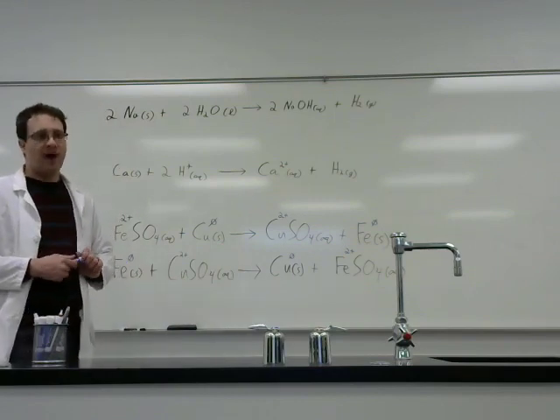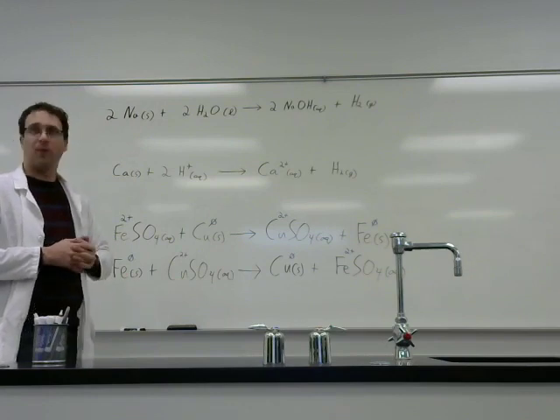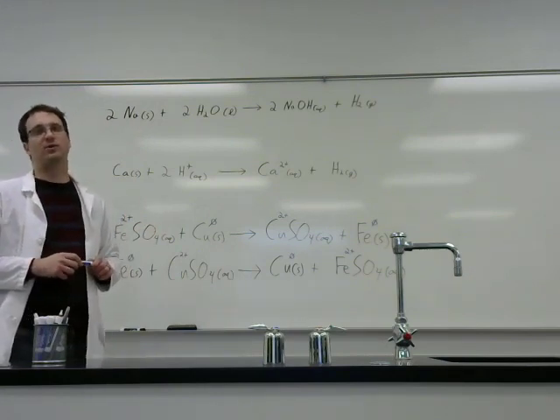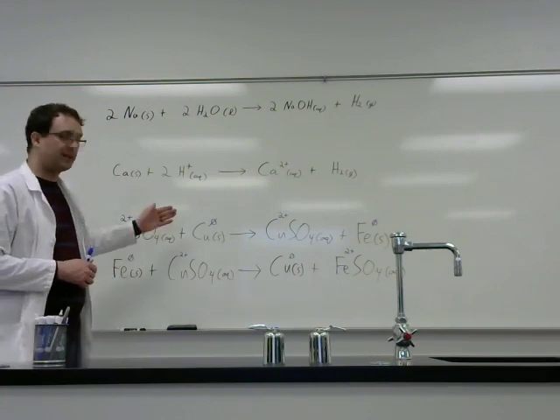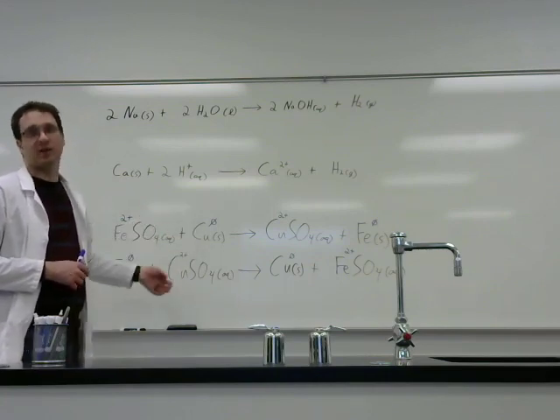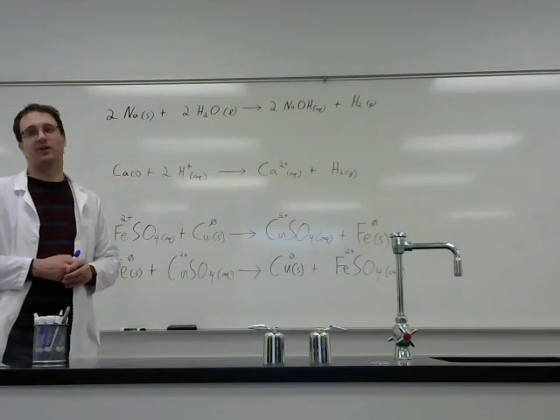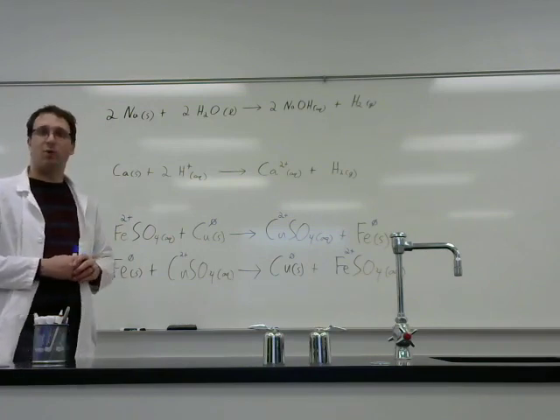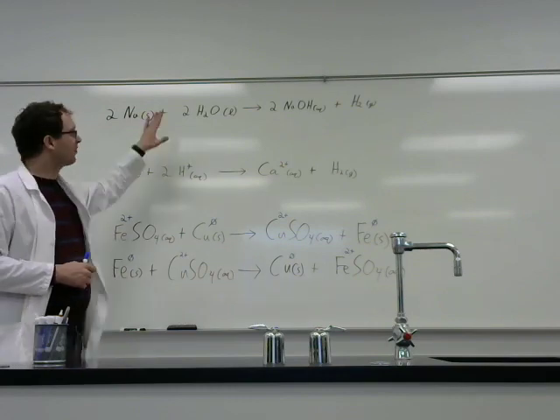If instead iron metal is more reactive than copper, then the bottom one will be what happens in nature. And so we'll use experiments to determine which metals are most reactive and make predictions about which of these then is going to be the spontaneous direction for this reaction to flow. And so we'll tell which metals are more reactive in different methods for all of these.